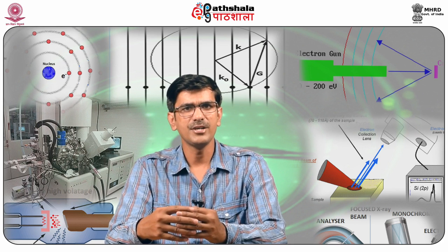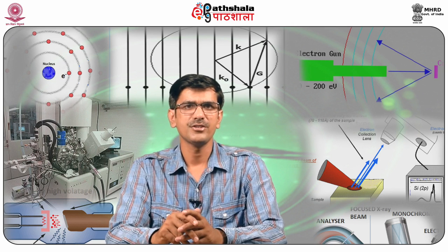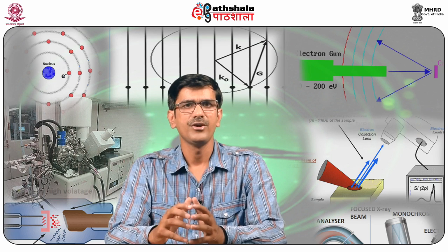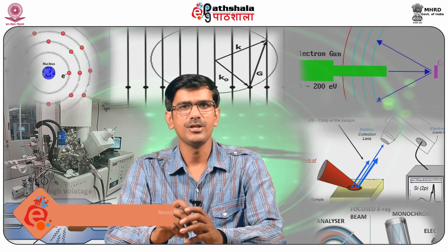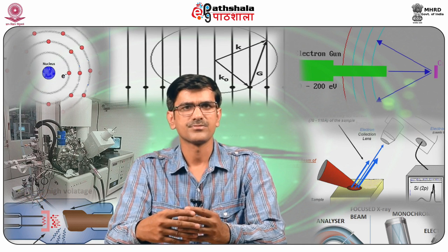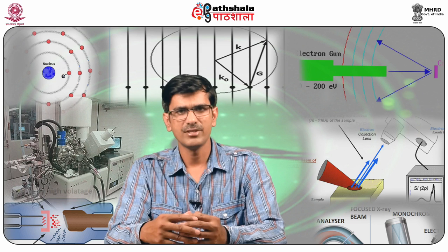This means identifying the dimensions of the unit cell and which peak corresponds to what position in the reciprocal space. The structure factor is a mathematical function describing the amplitude and the phase of a wave diffracted from a crystal lattice plane characterized by Miller indices. The structure factor is a critical tool in the interpretation of scattering patterns obtained in XRD. The reciprocal lattice represents the Fourier transform of another lattice, usually a Bravais lattice.